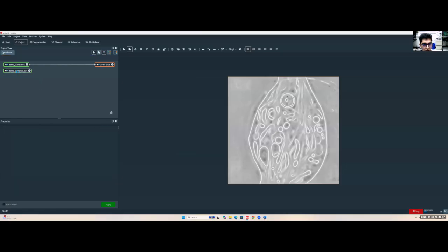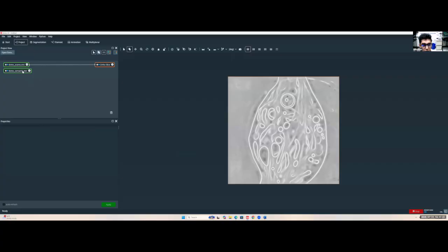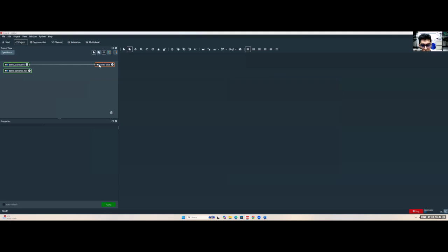So here, notice how this imported with no ortho slice. So if I want to create an ortho slice, we can go through that same process. Now, one thing I want to note is why we see this ortho slice here for demo scores and how we can turn that on and off. If you look at this module, you see this blue box that is highlighted next to the words ortho slice. You can click that to turn it gray. That turns it off. This is the viewer toggle. Turn it on and off like this.